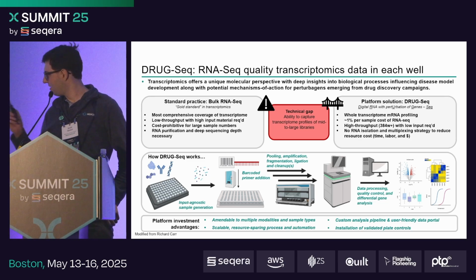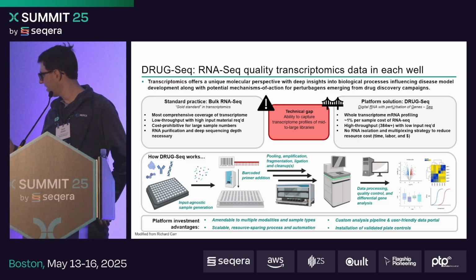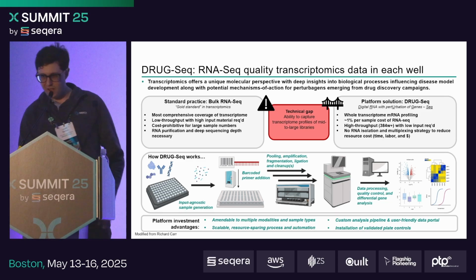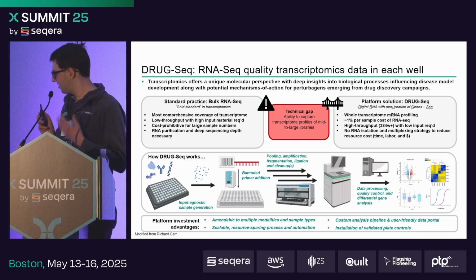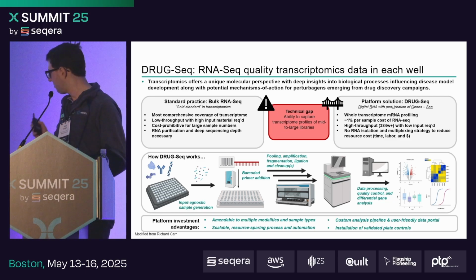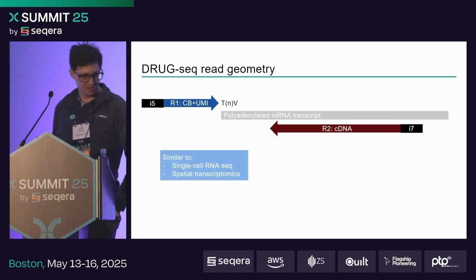And it works by performing your experiments in multi-well plates, attaching a barcode in the reverse transcription step, amplifying, sequencing, and at the other end, they generate this FASTQ data that they need processed into a counts matrix of unique molecules per well. And so that's where my team comes in, is to source or develop a solution for processing this data.